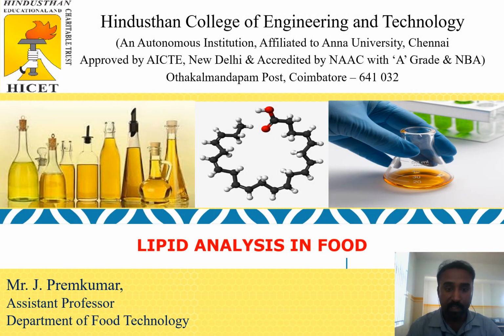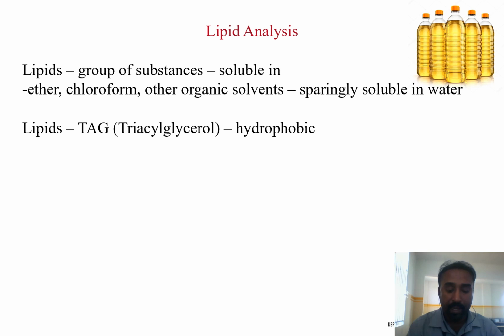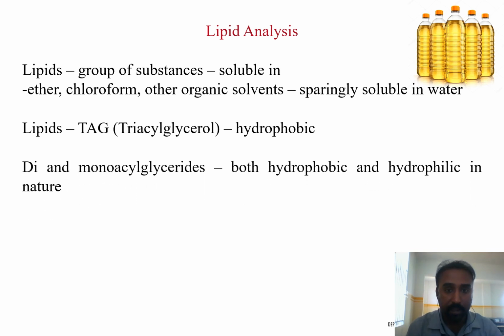Today we are going to discuss lipid analysis in food. This is one of the important analyses in the food industries and also in many quality control laboratories in the food sectors. We know lipids constitute two things, that is oils and fats. Collectively they are called lipids.